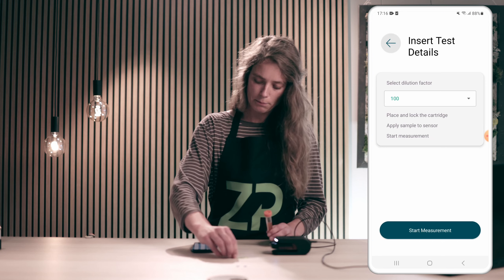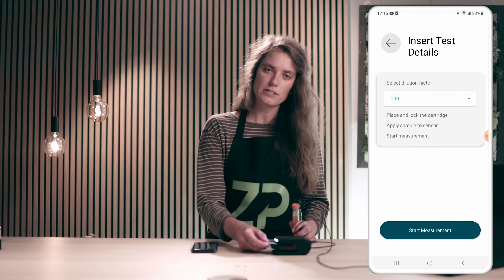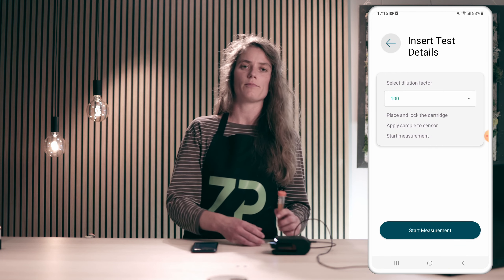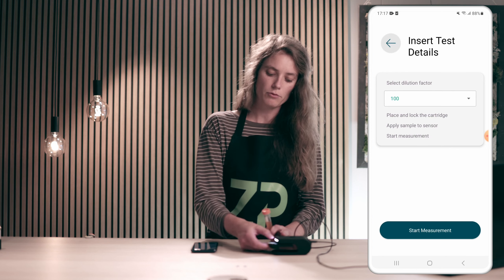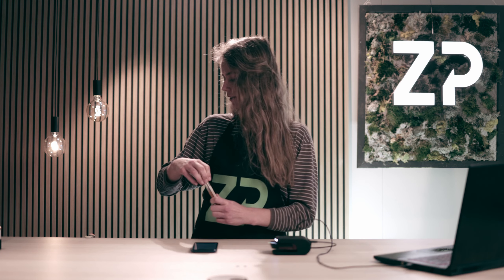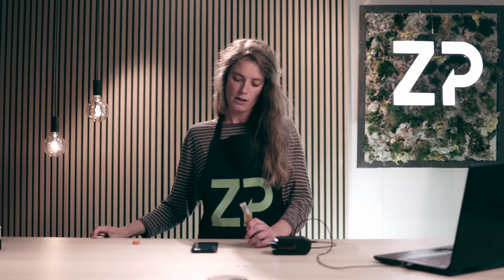Then I will place and lock the cartridge onto the device like this. As I mentioned, this cartridge that we've designed makes it easier for you to align the sensor to the device. I can even pull on the cartridge and it will stay in place — so it's impossible to misalign the sensor. Now that the sensor is inserted and the movable part of the device is moved upwards so the electronics are in contact with the sensor, I will apply 50 microliters of the sample onto the electrodes of the sensor. The light even helps me better see where I'm depositing the sample.